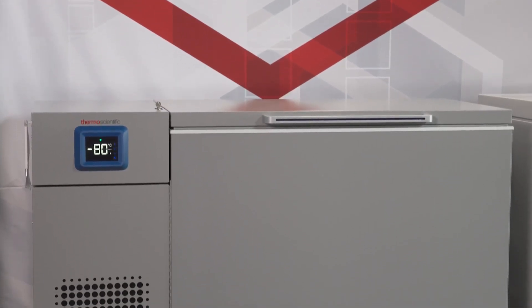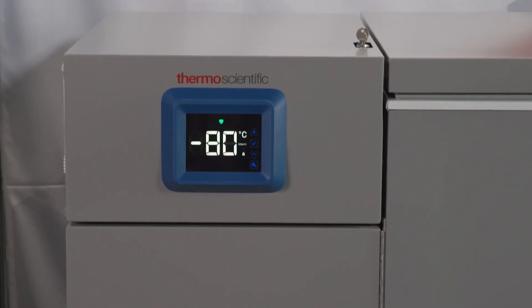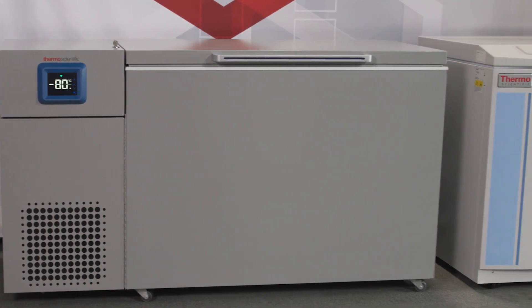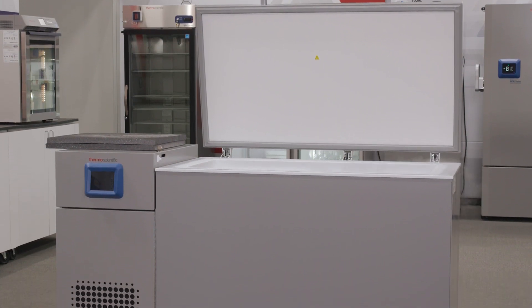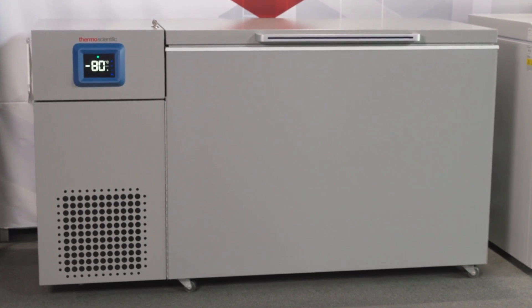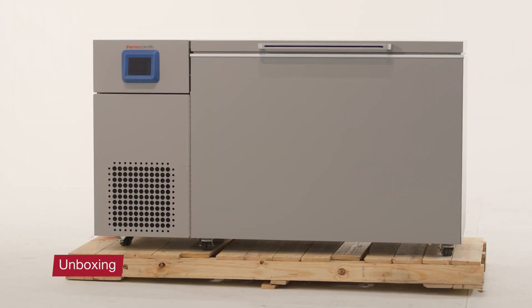Thermo Scientific TDE Series minus 80°C chest freezers, powered by the H-Drive system, enables a foundational ULT experience with the reliability, sustainability, and enhanced performance needed to protect your work. The combination of rapid door open recovery and tight peak variation make them perfect for frequent entry or long-term storage applications. In this video, we'll show you how to unpackage and set up the TDE minus 80°C chest freezer upon arrival.